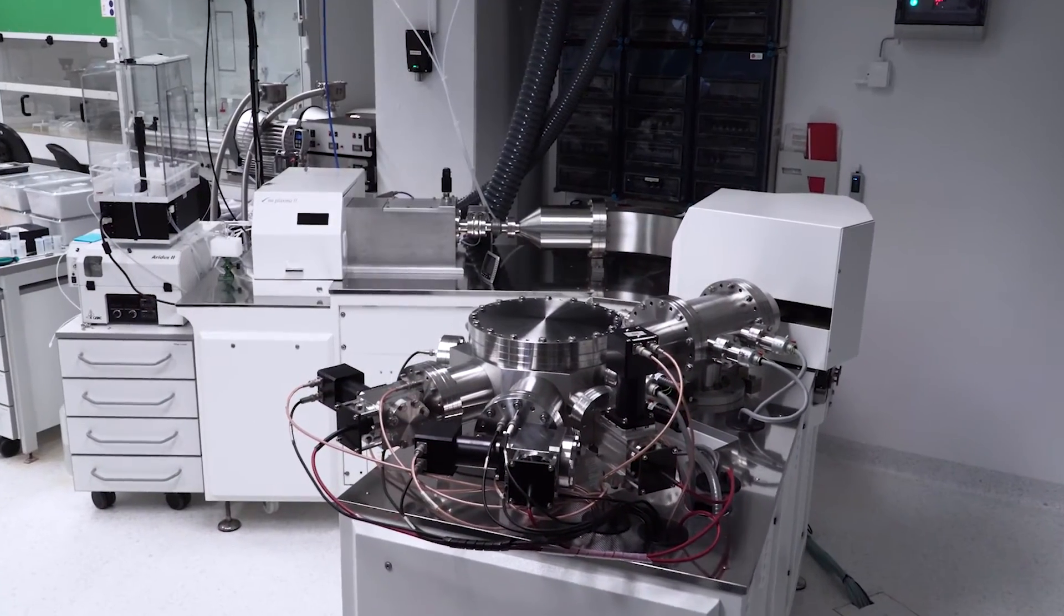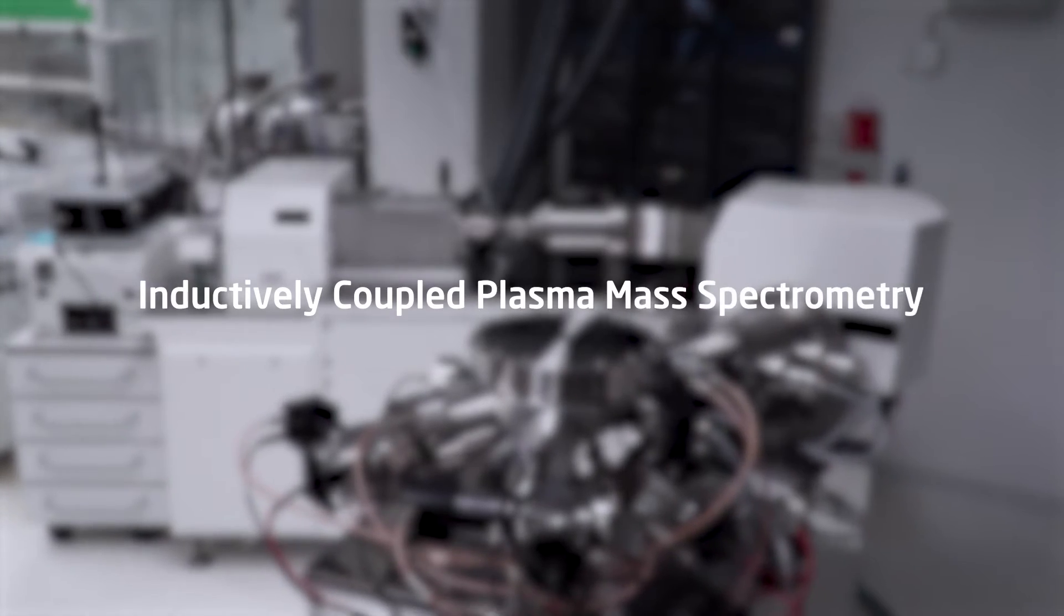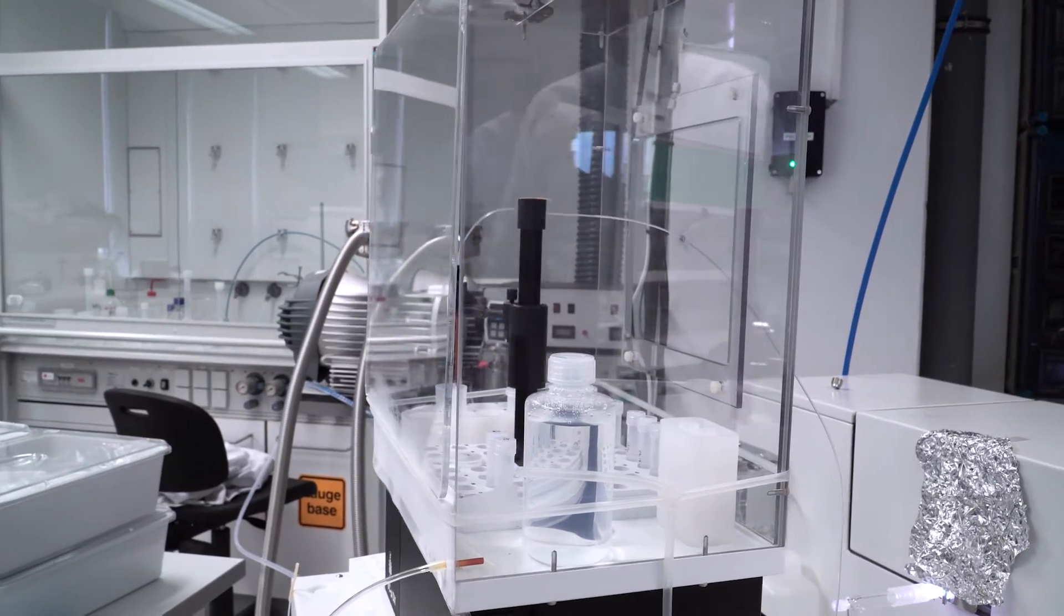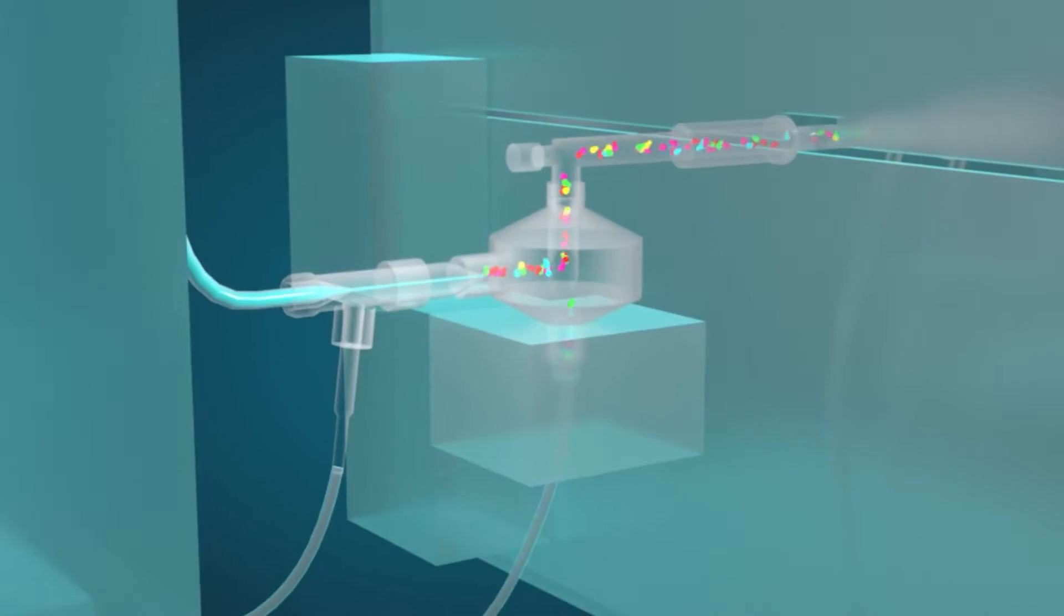ICP-MS stands for inductively coupled plasma mass spectrometry. In ICP-MS, the liquid sample is converted to a very fine spray in a nebulizer.